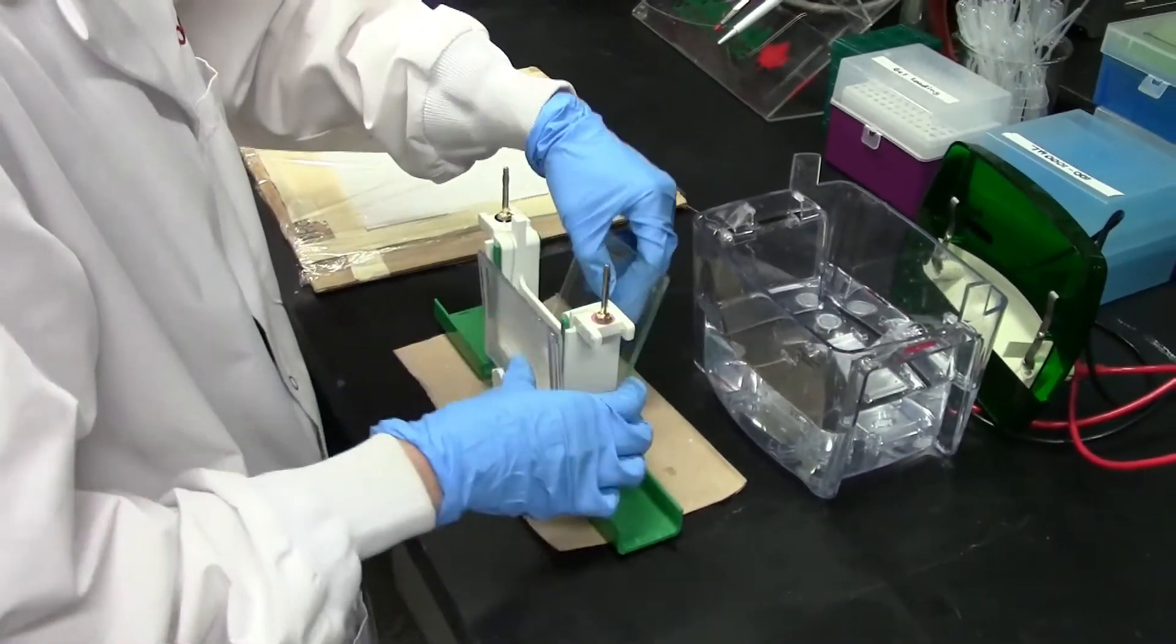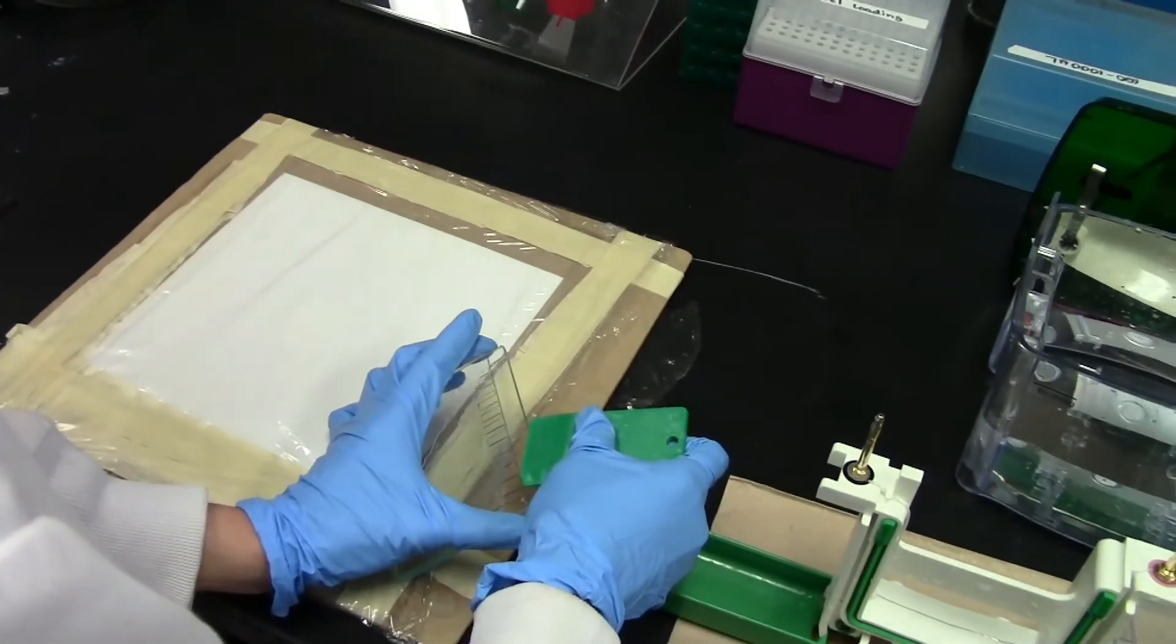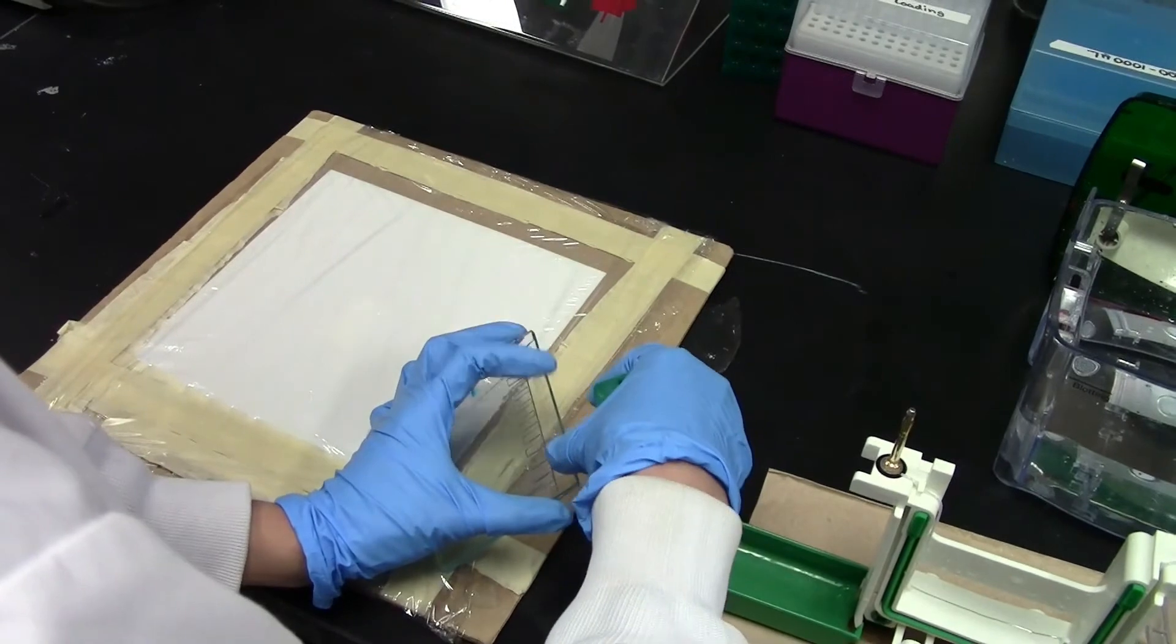To visualize the gel, remove the electrode assembly from the buffer tank and take out the plates holding your gel. The used buffer can be conserved and reused to fill the bottom of the buffer tank for other gels.